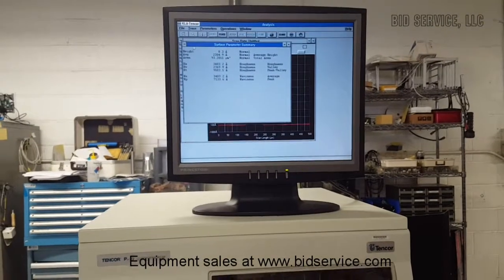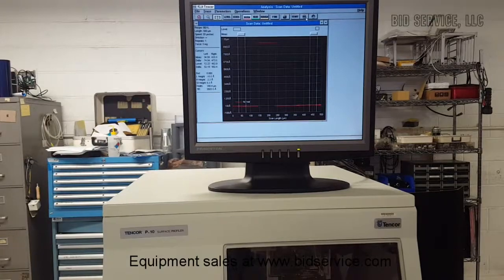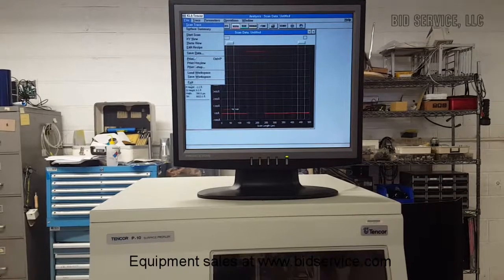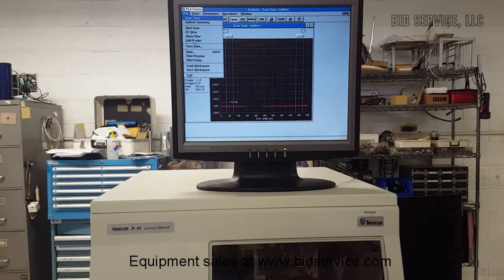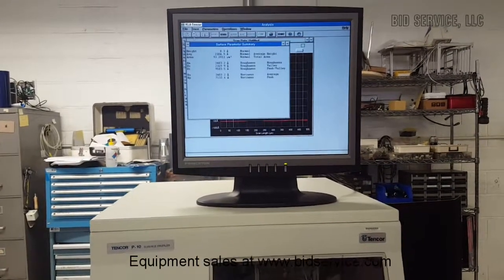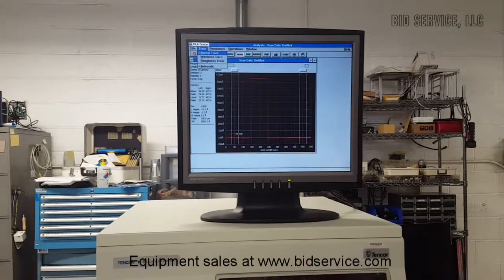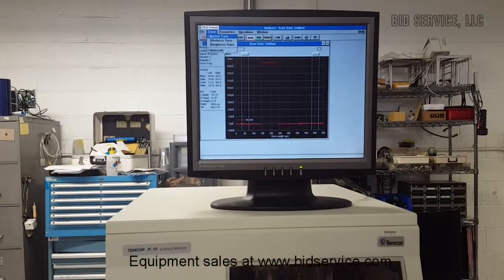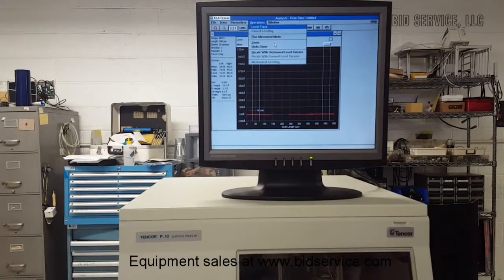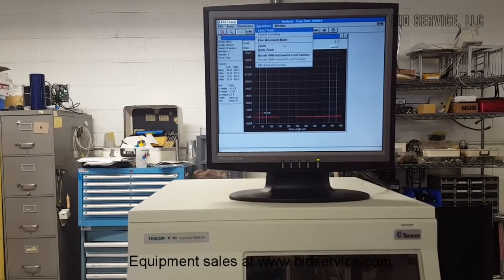And so once these are done, we go back to the main screen again, and we can edit a recipe at any point of time in this screen as well, and then we can display the surface summary, and then we have various operation options also listed here.